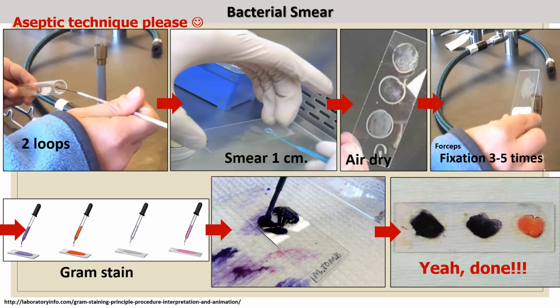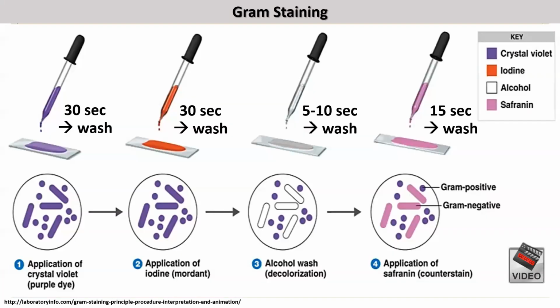And then move on to the gram staining area, which I provide you at the sink close to the window. And after you finish the staining, you need to absorb all the leftover water, and then your slide will be ready to be observed under the microscope.